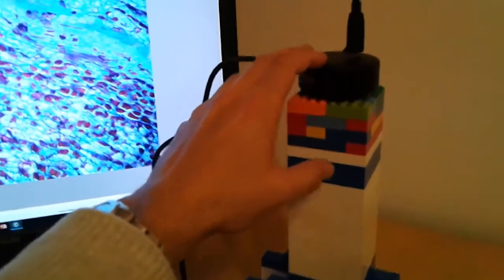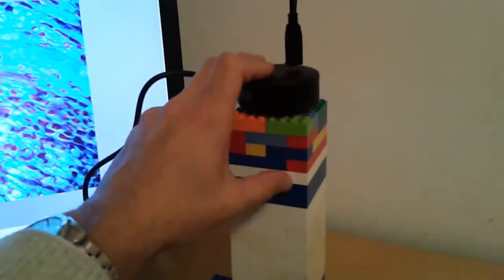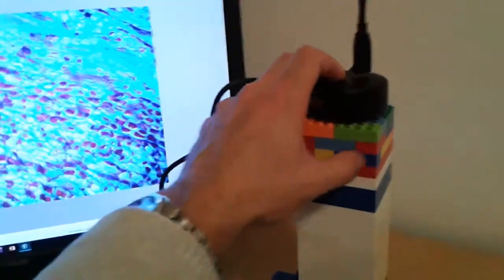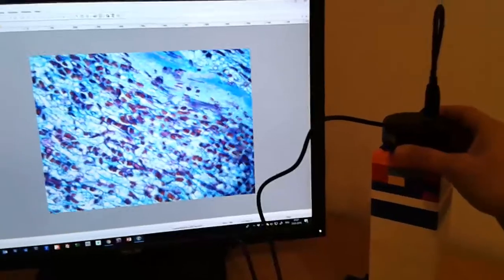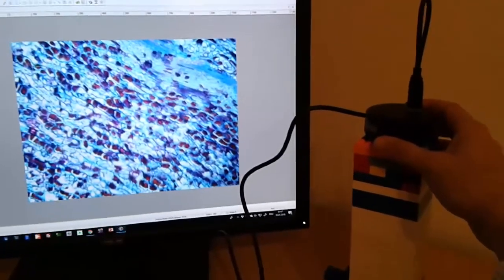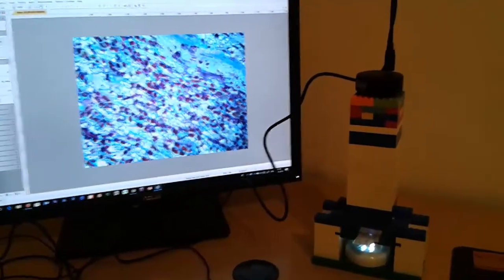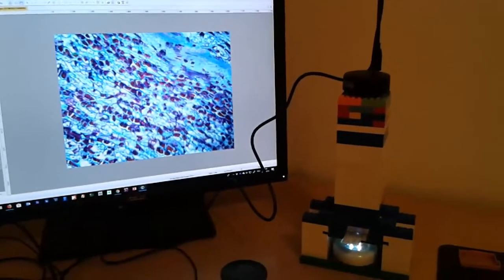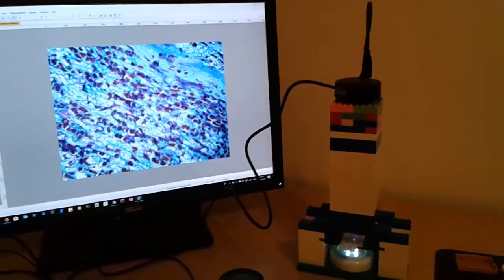To increase the stability a little bit, I simply added a few layers of Lego bricks. Now I ran out of the same color Lego bricks, so it's a little bit more colorful, but it works. The distances are just right and I'm getting a nice picture this way. I think that's a nice and very straightforward way of doing some amateur microscopy as well as constructing your own microscope, and I'm quite happy that this little project worked out so well.